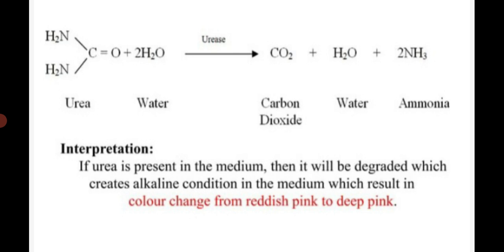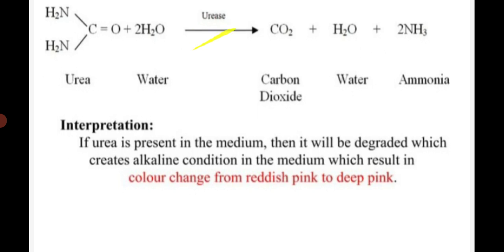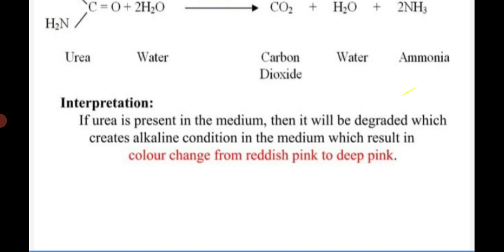In this test, urea is hydrolyzed by the enzyme urease to carbon dioxide and ammonia. Interpretation: after inoculation and incubation, if the medium shows a deep pink color, then the test is positive.